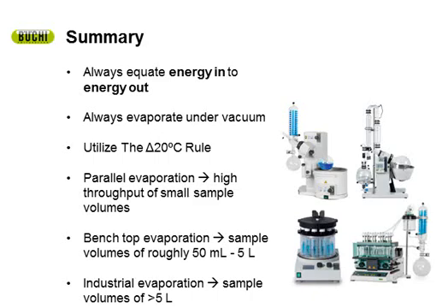What are the advantages of working with an all-in-one rotovapor? A, the evaporation process is more efficient. B, you consume less energy. C, there's higher automation. Or D, all of the above. I'll give you a couple minutes for this.